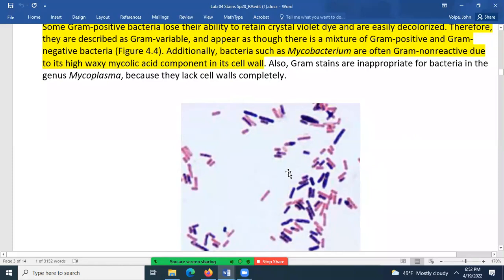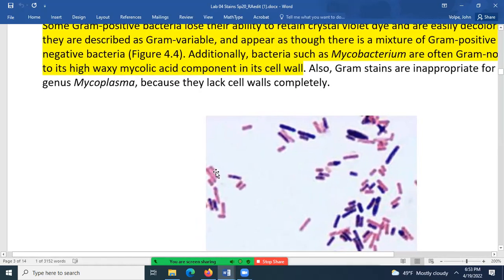The texture is correct. Not the shape, they are both bacilli, okay? But this cell here, and that cell here, and that cell here, these are all ghostly cells. That cell is very intense. Same with that one. So these cells have a very distinct boundary, very sharp boundary between the cell and the end of the cell. Whereas that cell and this cell and this cell, they don't have as sharp of a boundary. This one in particular, you can see that that cell looks like it's almost broken.